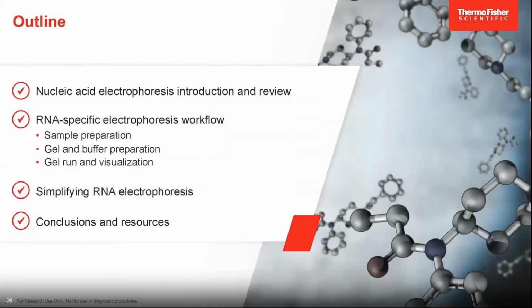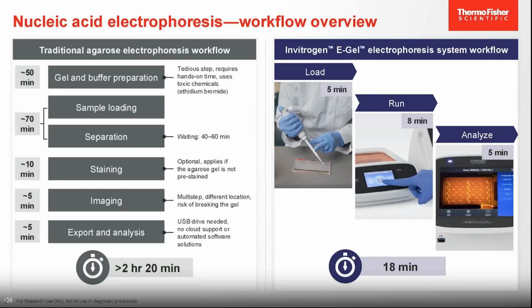So we will cover several topics here. We will cover the general nucleic acid electrophoresis as an introduction, so we have a baseline, and then we'll go through the RNA-specific electrophoresis workflow, covering the sample preparation, gel and buffer preparation, as well as gel run and visualization. And we will proceed with the simplification steps available for RNA electrophoresis, and finally some conclusions and resources.